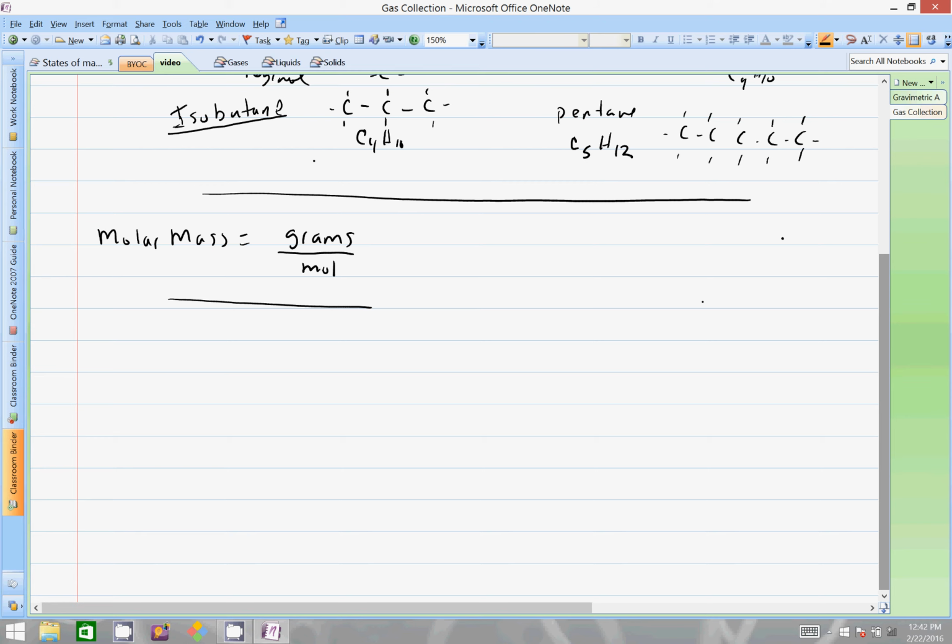First things first is we're using a lighter, a typical stick lighter is what we'd be using. And if you know the gas, or you think you know what's in a lighter, well, then you can use this experiment to sort of verify what you know. You obviously could possibly even Google what is in a butane or isobutane, or is it methane, or what is in a lighter.